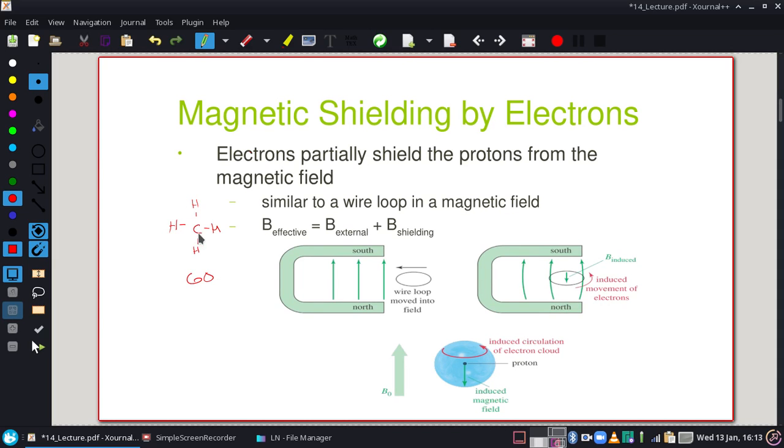All right. But if I look at the same type of hydrogen, but it's attached to, say, an oxygen, the oxygen being a lot more electronegative is actually pulling more of those electrons towards it. So this hydrogen is less protected by those electrons. And we see something neat. Even though the radio frequency waves that are coming off this are because of the hydrogen spin and how that nucleus's spin state flips from one direction to the other, the electrons around that hydrogen protect it from that magnetic field.